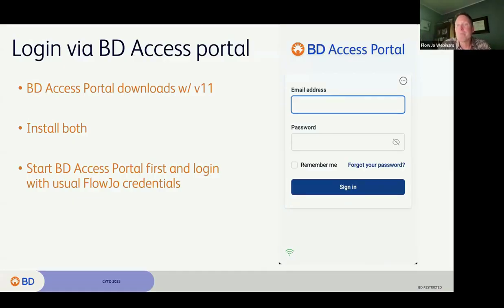As of 11.02, through the little three-button tool, there is also now a way to add proxy settings as well if you work behind a firewall.